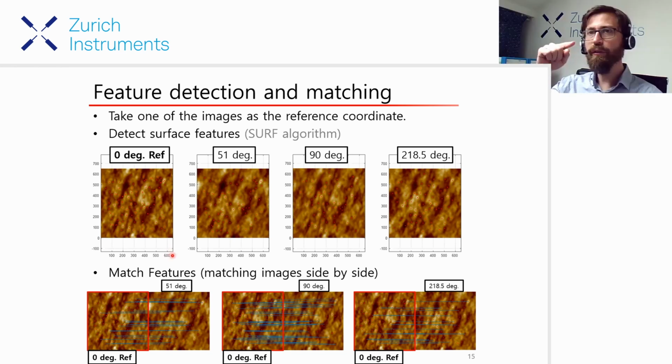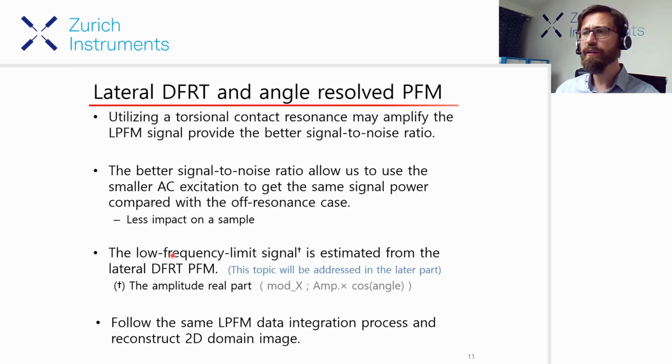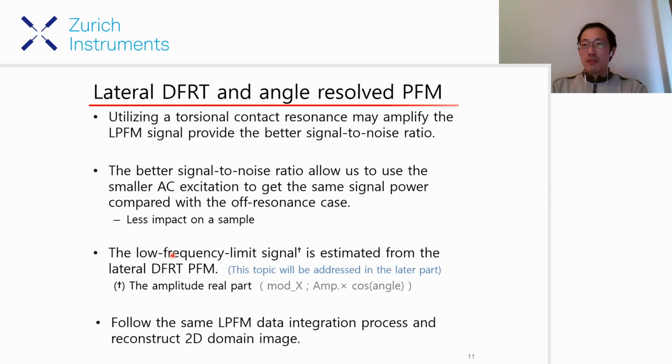So I see that you are reconstructing in the plane, so the vector in 2D, but you also have the vertical deflection in principle. Can you reconstruct the whole 3D, or is this something I missed? That is in principle possible. In my talk, I did not integrate the out-of-plane motion into my 2D map, but it is possible to integrate it too. But the problem is we have to calibrate properly the out-of-plane component and the in-plane component.